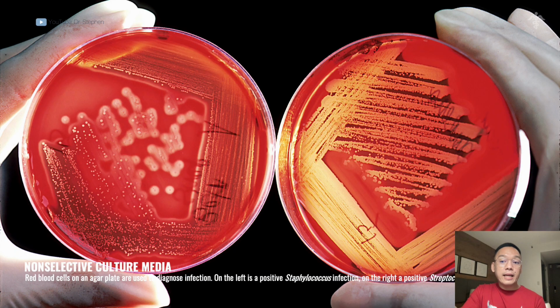This is a blood agar, okay? It is part of the non-selective culture media, or the generalized culture media. It will allow the growth of many or almost all microorganisms. In the recovery of fungi and bacteria, this is also used.